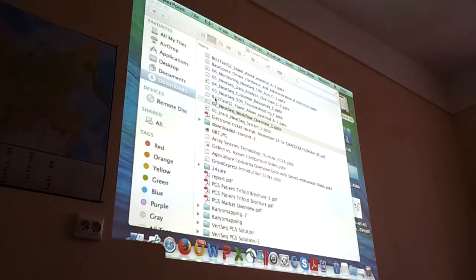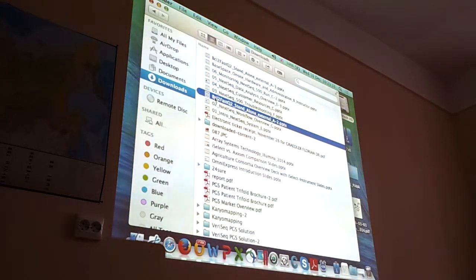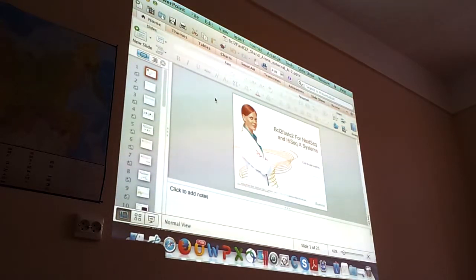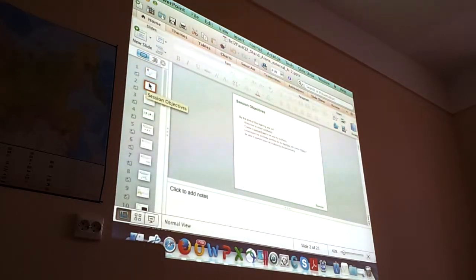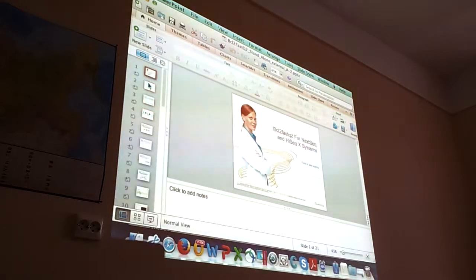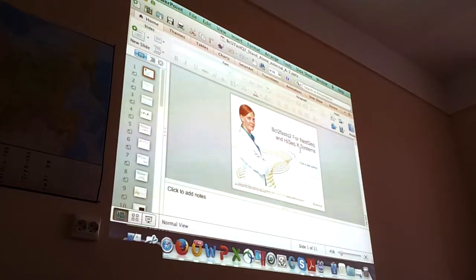Maybe quickly this BCL to FASTQ. The problem is they have no Linux machine here, so maybe it's not usual. Okay, we can also skip it. So basically, you use it only for NextSeq. HiSeq X, you don't have it.